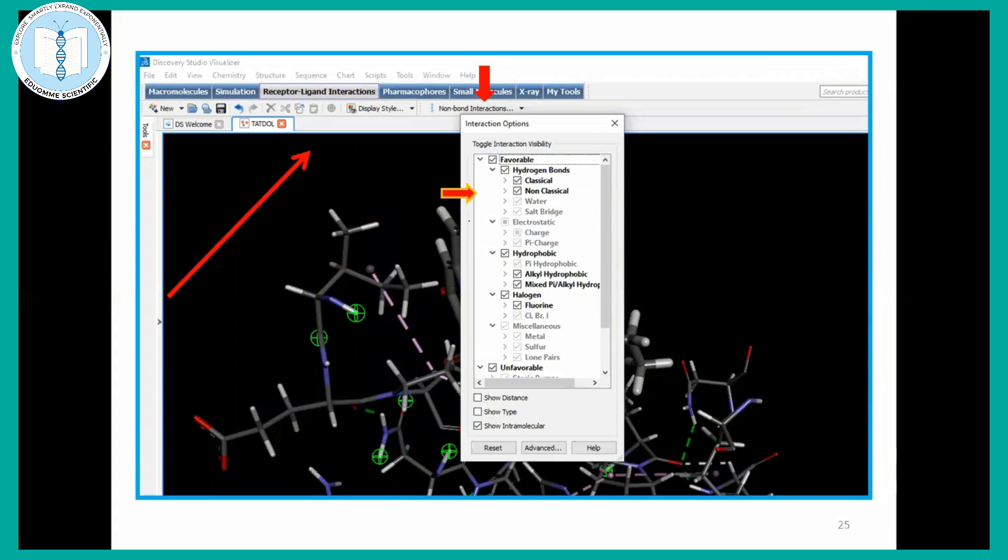And while performing these kinds of interaction visualizations and when you are making your file ready for publications, many a time, you just have to go to this non-bond interaction. Whether your focus is on classical hydrogen bond or which kind of bond interaction you want to highlight in your studies, that also can be achieved from this section. You just have to go to non-bonded interaction and from there, you can do these things.